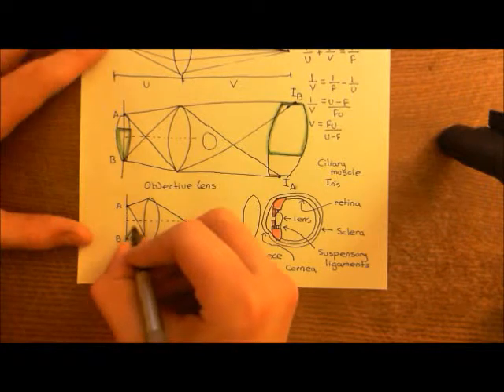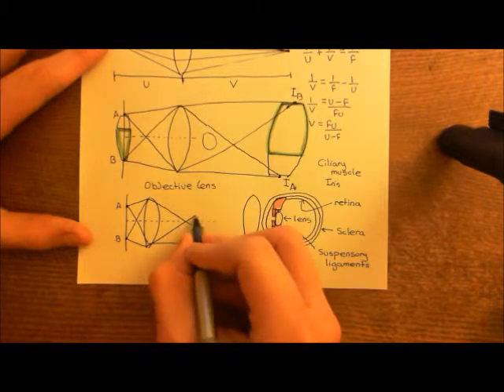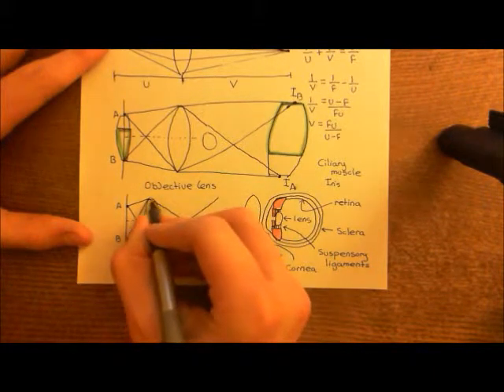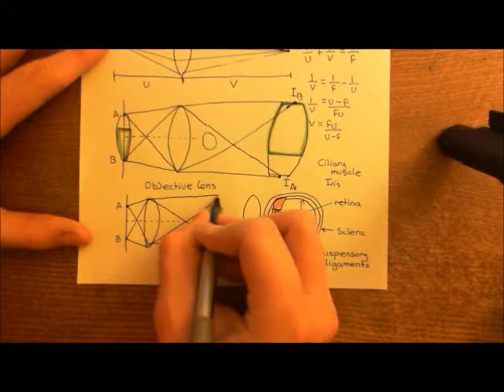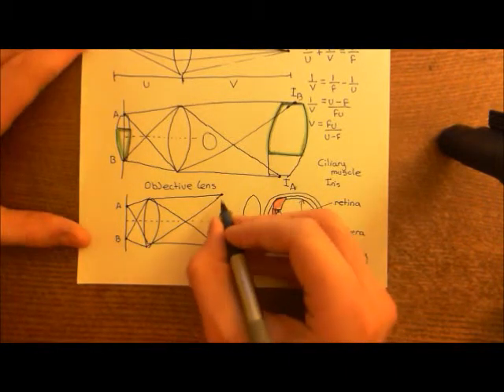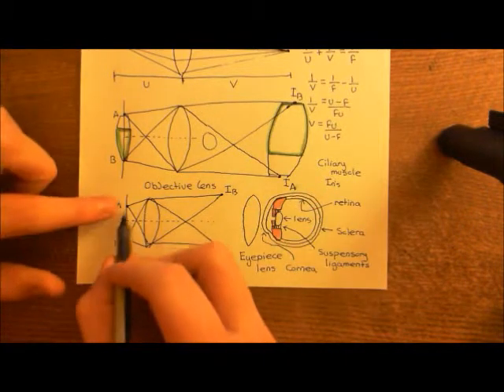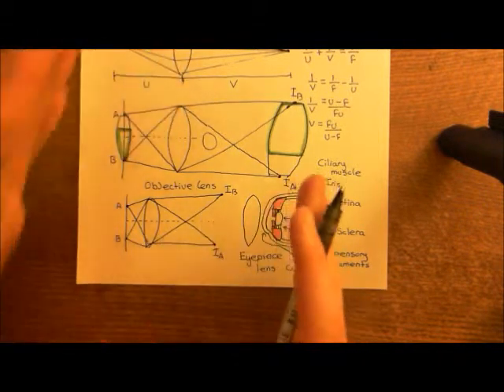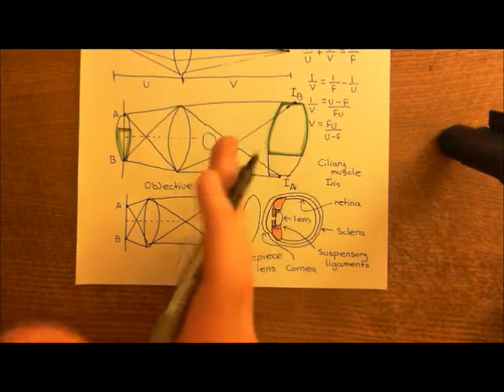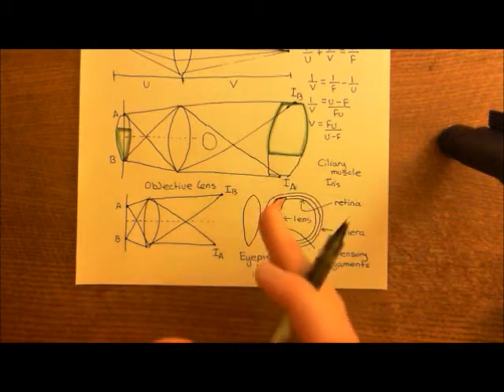Okay, so here comes all the light from point B, and it might all be focused up to some point over here, which we'll call the image of B. And that will have hugely magnified the image, basically. So now you'll have a bigger image, just like the highlighter pen. The image here will have now been turned into a bigger image that is ready to be seen here, if only we could actually see it.